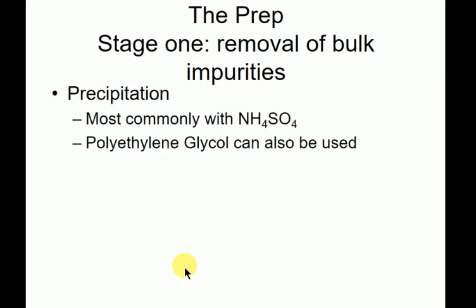So if you want, you could precipitate most of those out with ammonium sulfate or polyethylene glycol. Hope your protein isn't attached to them, right? What's to say your protein doesn't localize to one of those things? So you should be very careful during the precipitation step.